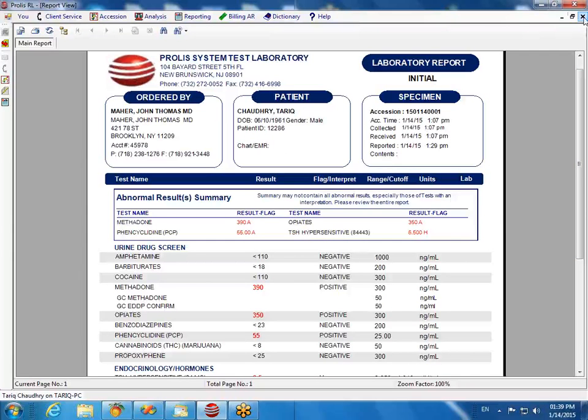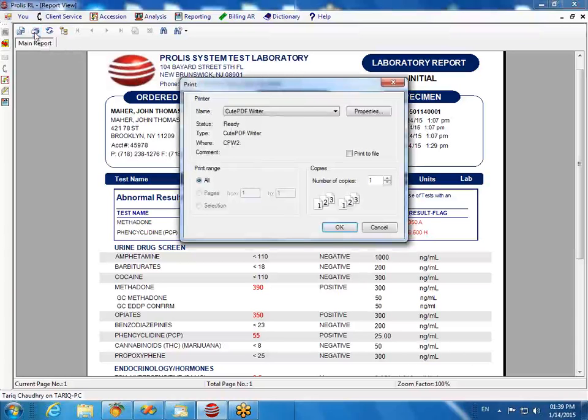We can research it. Any more questions from the other people you have sitting there, Ahmed? I can answer them right now. I want to print this page. Just keep it as an example. Yeah, keep it as the example. Okay, I'll tell him to email it to us. Yeah, the lab can say, can you email or screenshot whatever of this lab report picture? Oh, absolutely. You could create a PDF. You could print it on the printer. And so let me create a PDF.